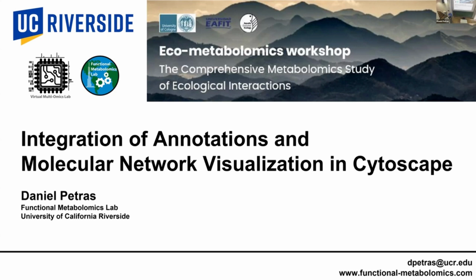So yes, this is, I guess, the most fun part, because we're bringing these different layers of annotations together. Both what we did yesterday in the feature-based molecular networking, as well as what Marcus just showed you. And then technically, if you have any other preferences for annotating your spectra or putting some other sort of meta information into it, that will also be the moment where we could bring in those different annotations.